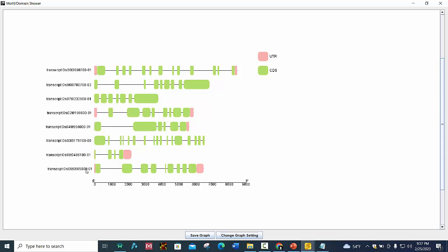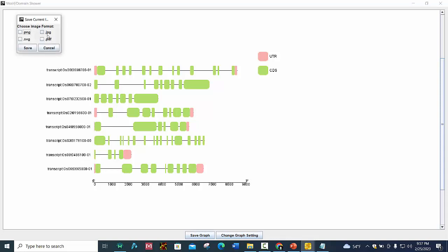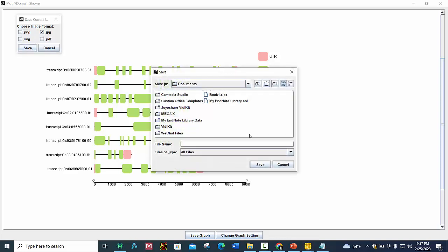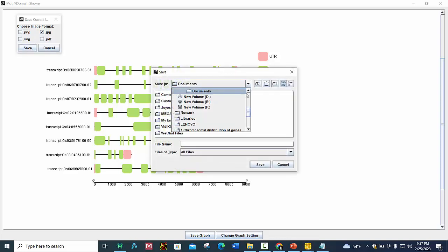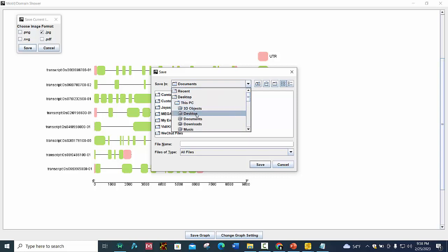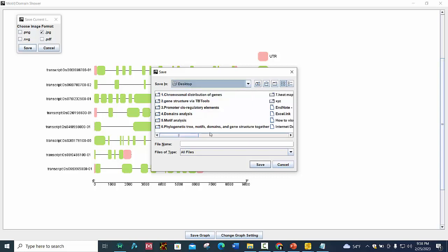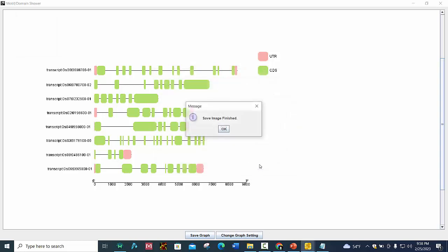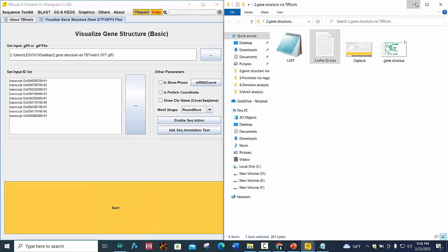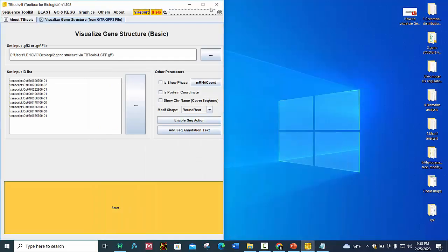After making your desired changes, by pressing Save Graph, you can save it into JPG or PDF format. Select where you want to keep your file and give it a name and press Save.